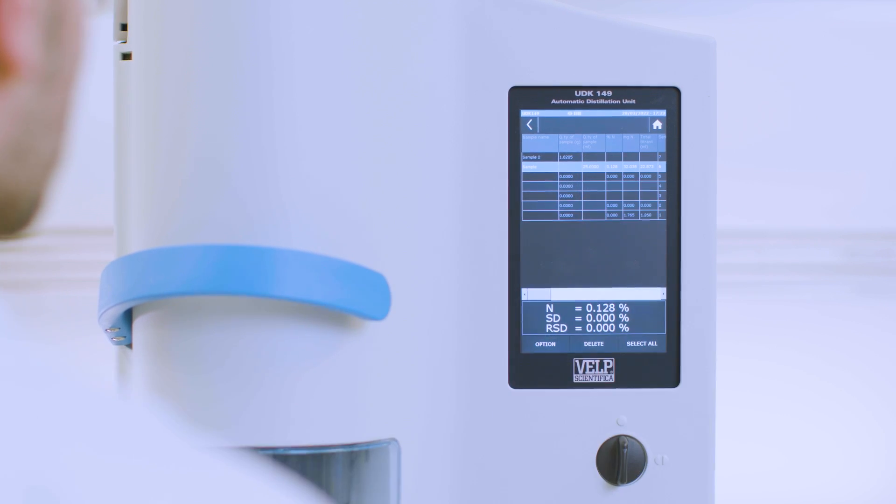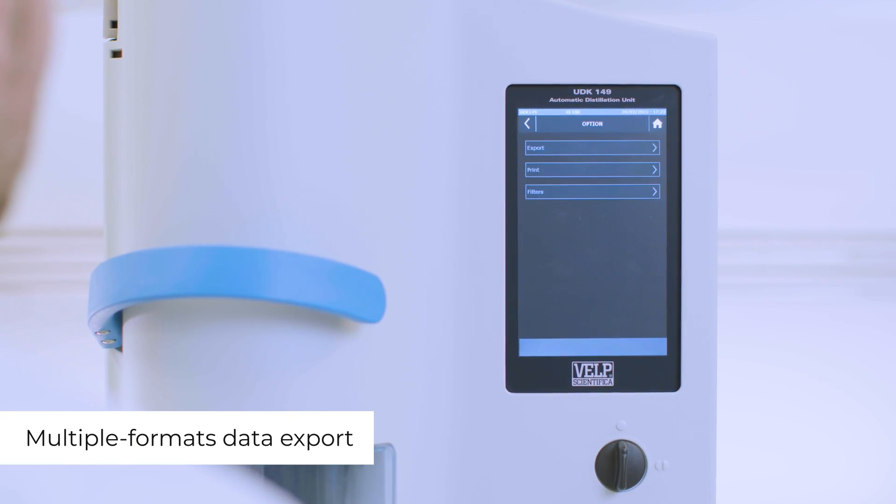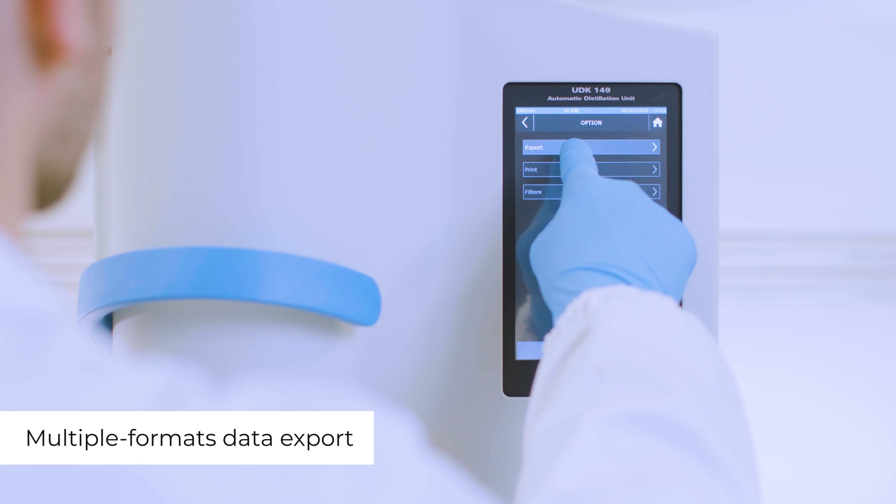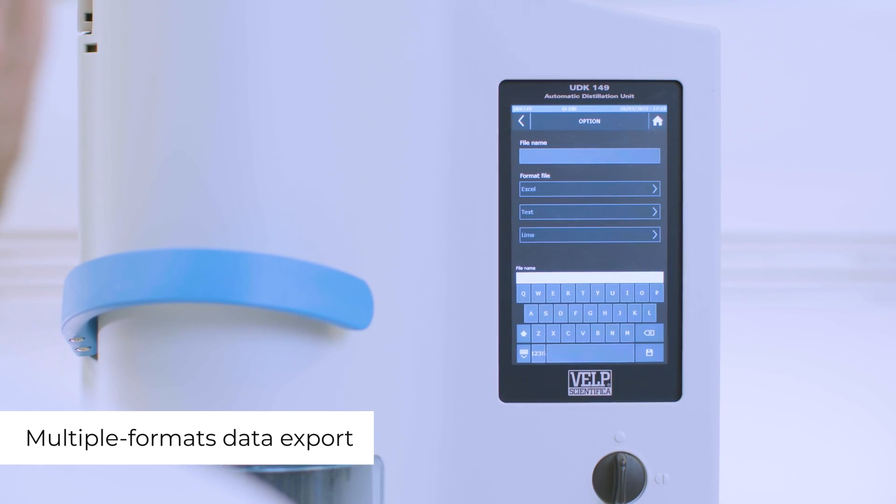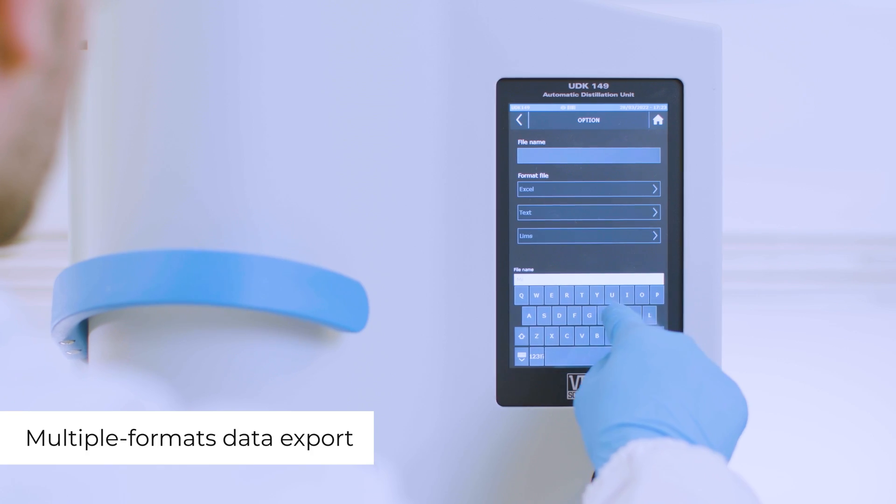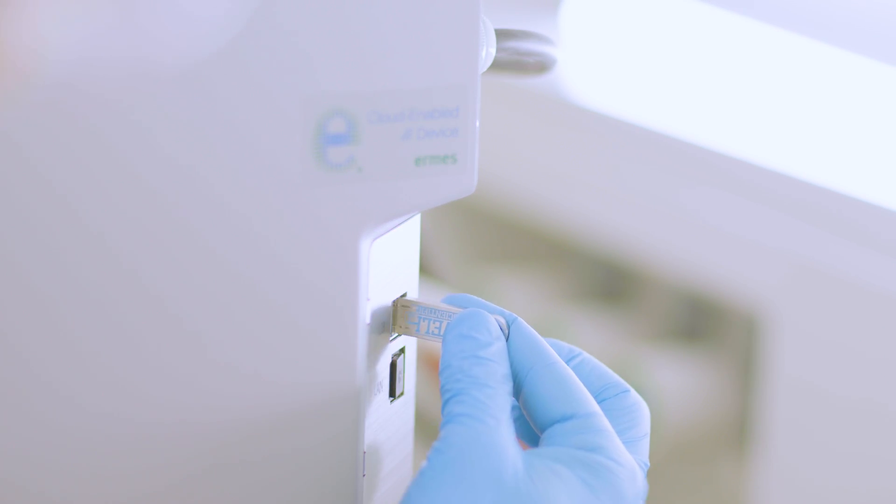The UDK 149 stores the analysis results in the onboard archive. It is possible to export data to PC and LIMS in multiple formats via USB or Ethernet.